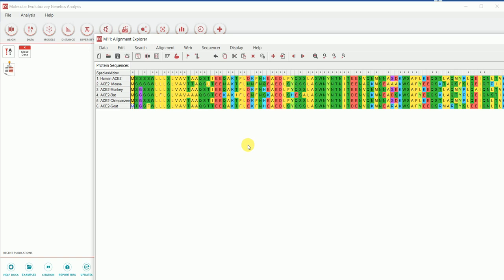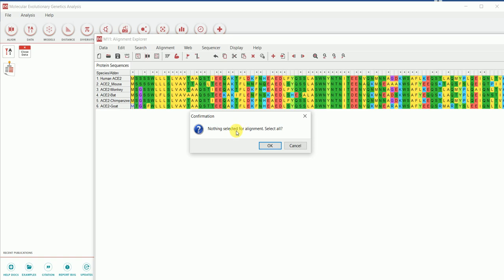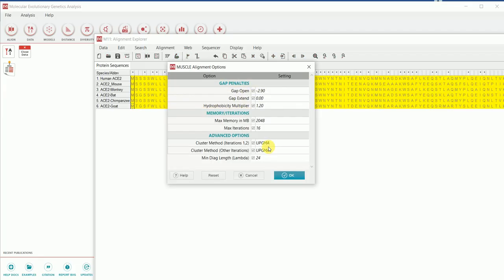Now my protein sequences are in the MEGA 11 software. I need to perform alignment. You can directly click 'Align Using MUSCLE Algorithm,' or go to the Alignment menu which offers ClustalW or MUSCLE. I'll use MUSCLE as it's most commonly used in our laboratory. The program asks to select all sequences — I'll press Yes and OK. It then asks about gap open penalty, gap extension, hydrophobicity, and other parameters. For demonstration I'll keep everything as default and hit OK.